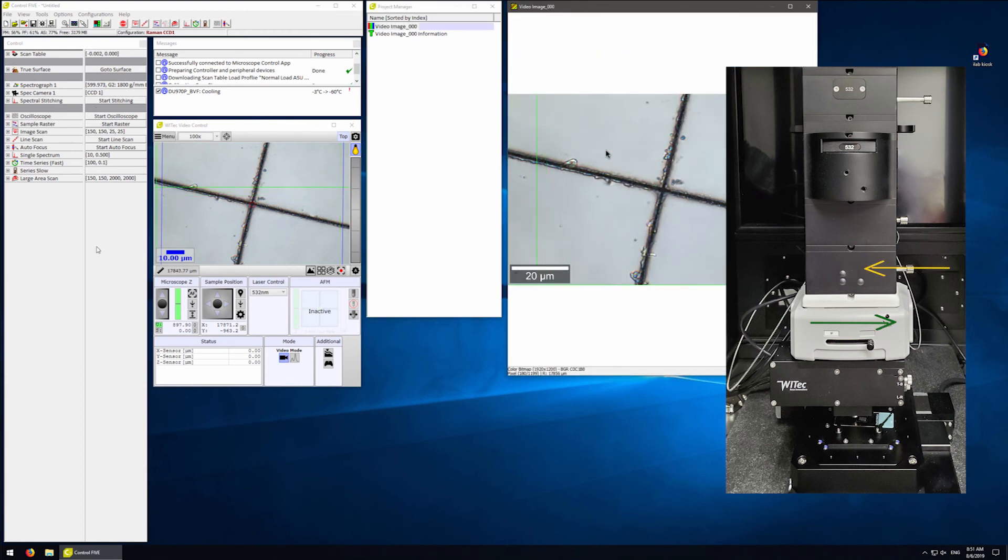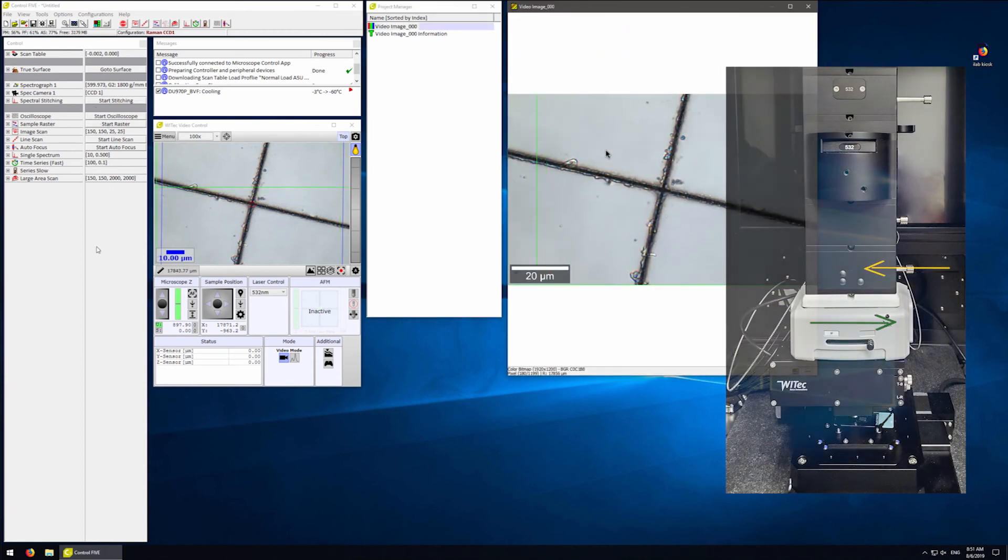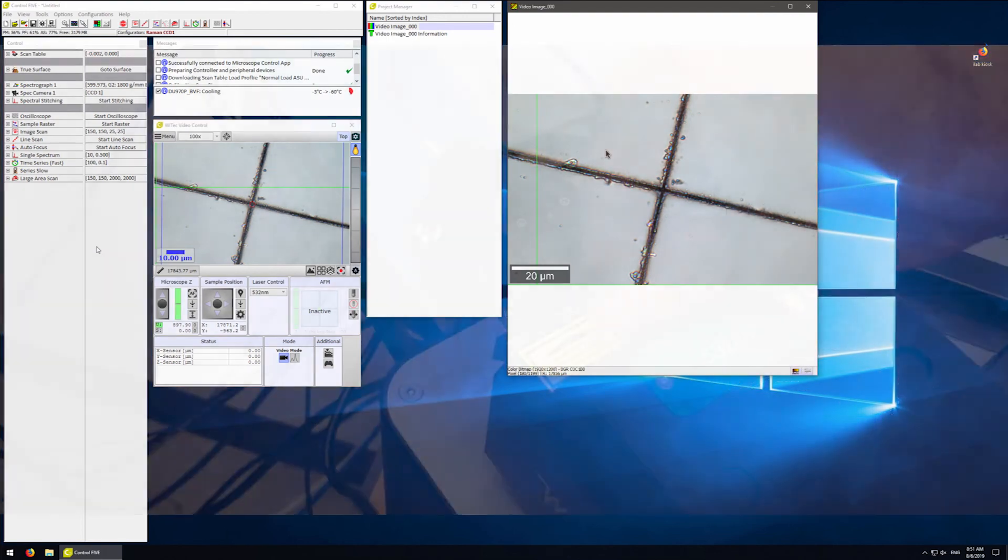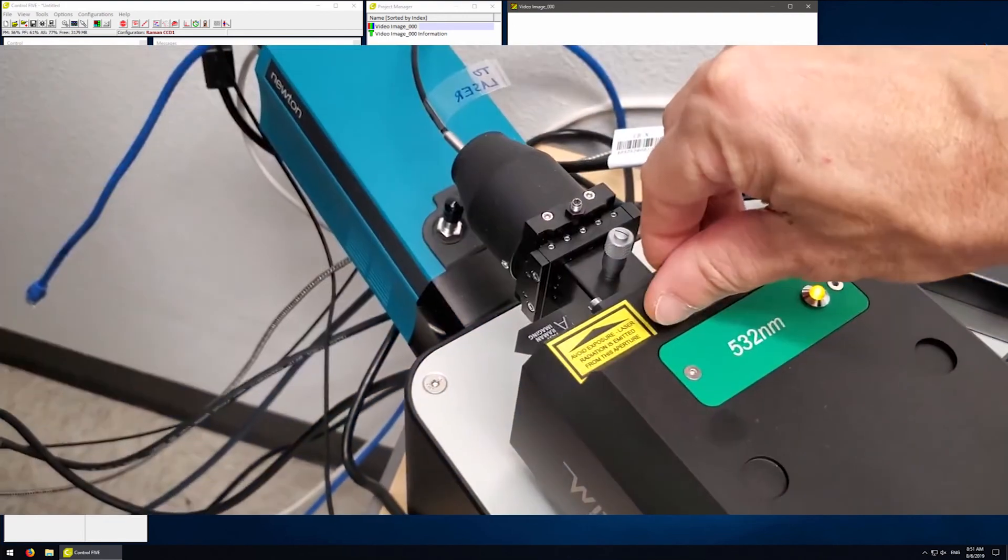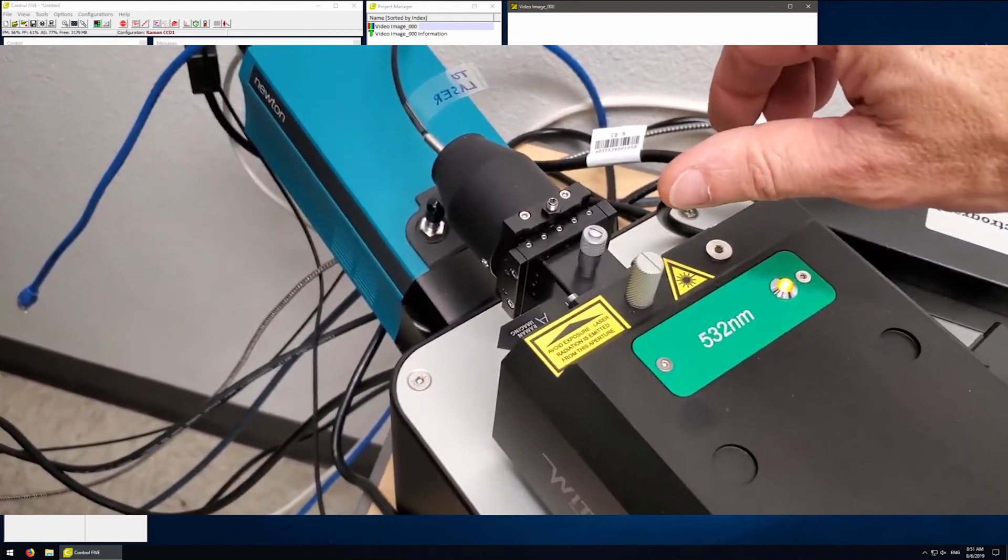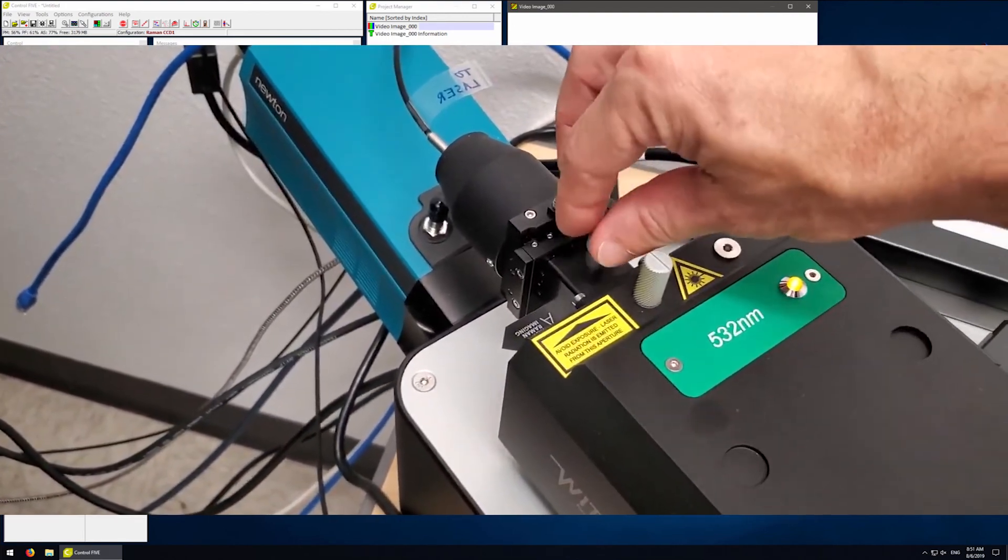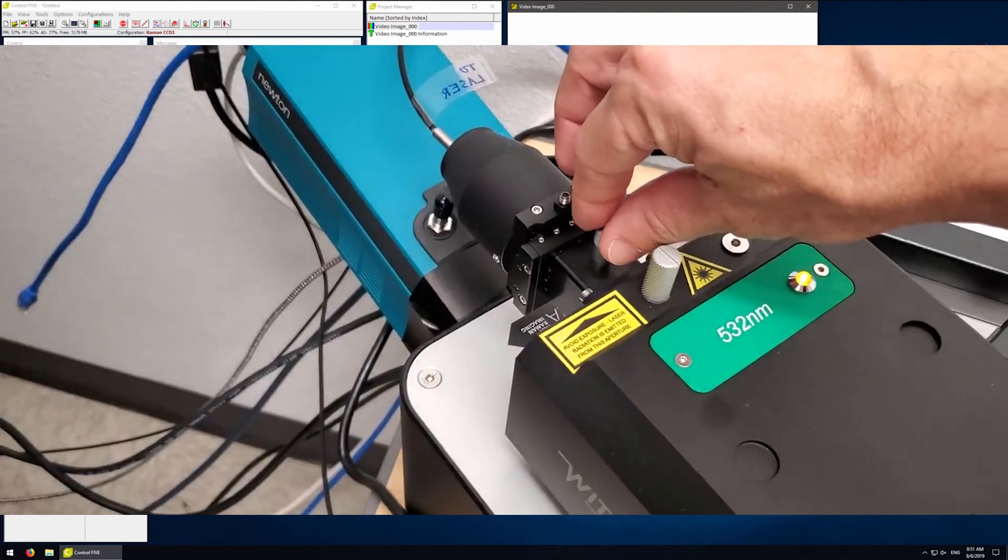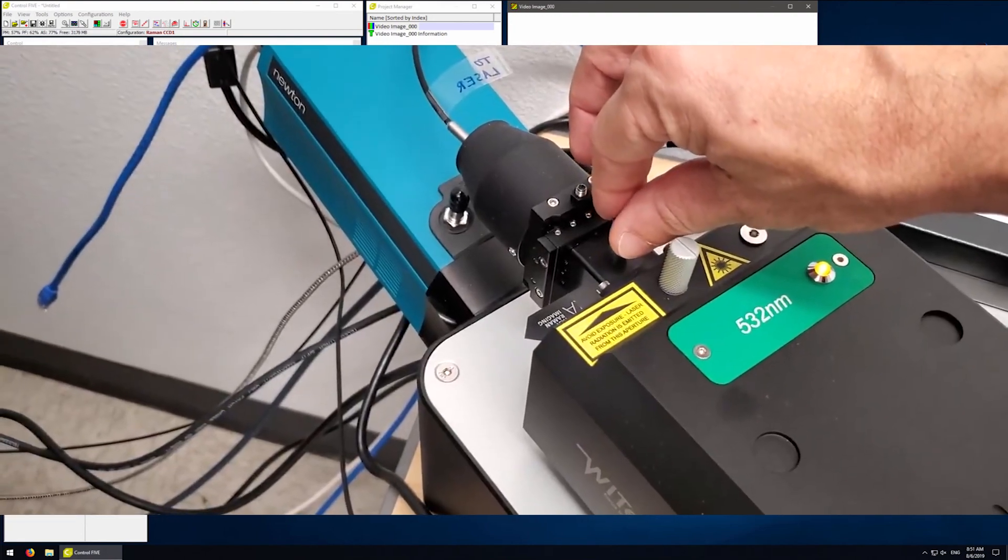By switching the appropriate knobs, we need to open the laser shutter by rotating this knob. The laser power is adjusted by rotating this micrometer.